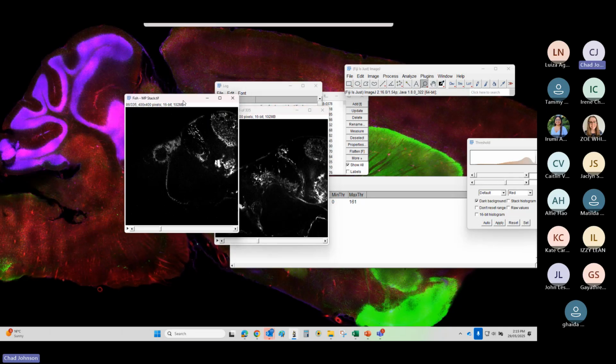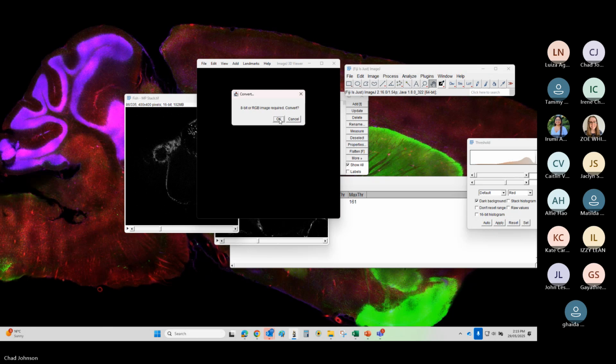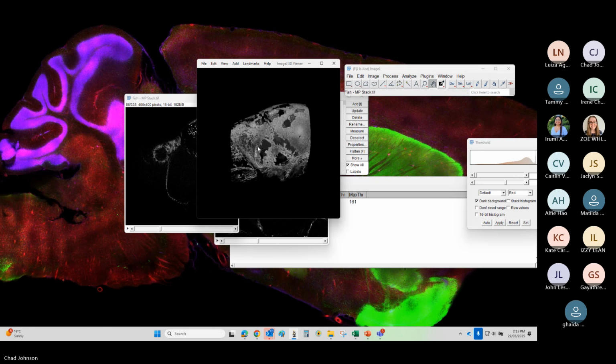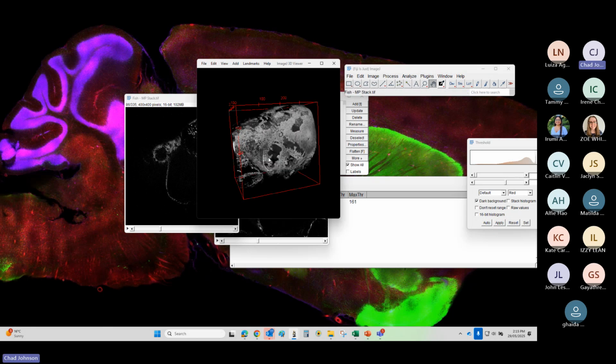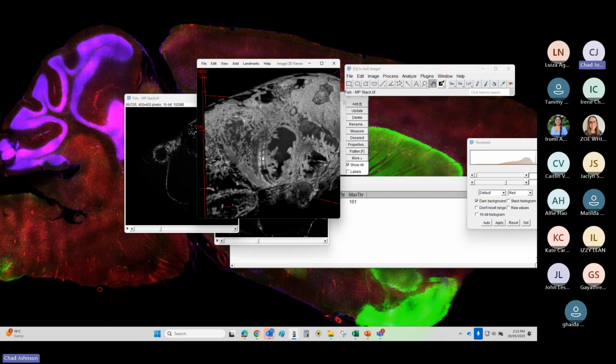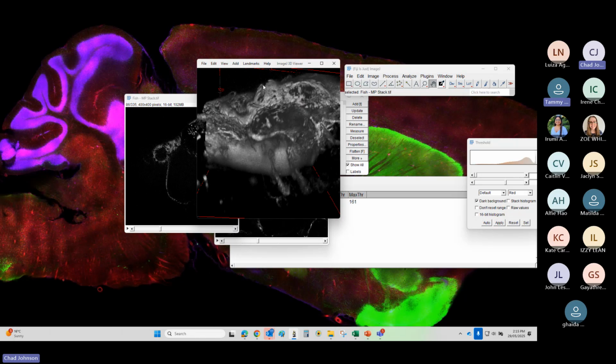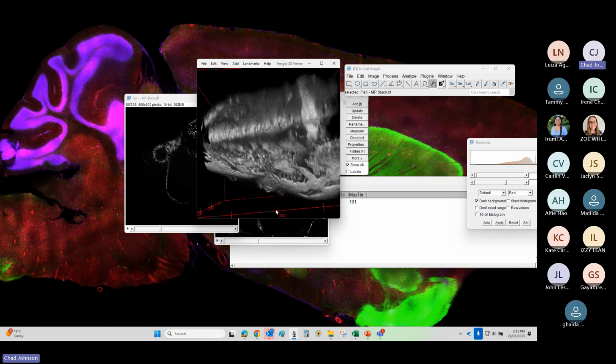And you can typically tell, I'll see if I can do this in the 3D viewer. Doesn't fall over. So you might be able to see here, in the 3D view, you can see the problem there. That's actually thrown off the reconstruction because of the movement.